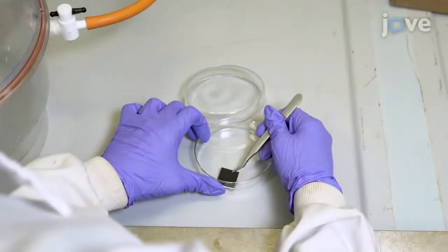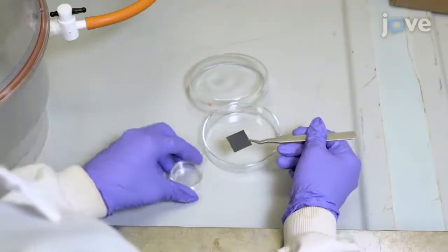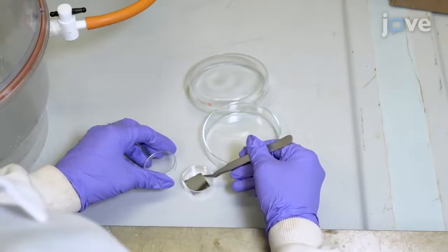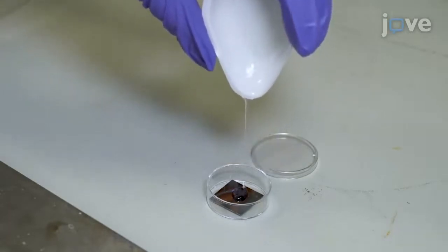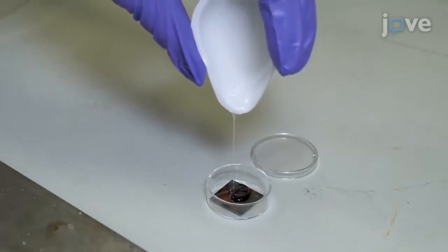Then, place the silicon master for the PPL array in a four centimeter petri dish. Pour the degassed PDMS pre-polymer mix over the master until it is fully covered.